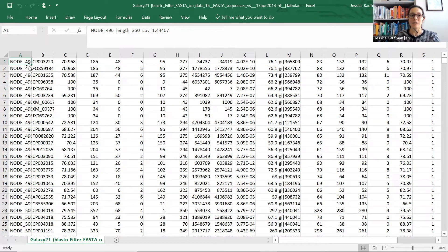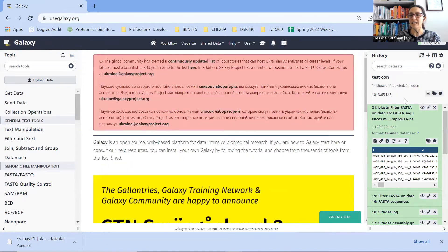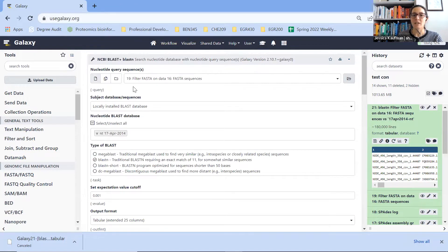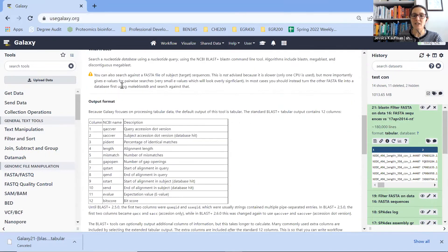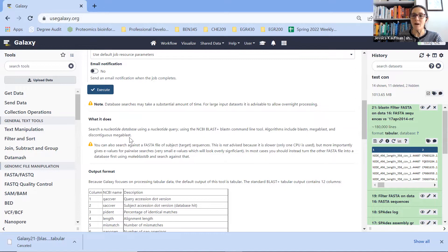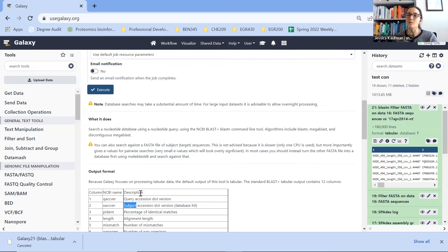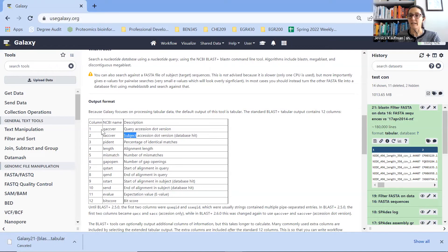The first thing we need to know is what data is in each of these columns. We can find that out if we go back to Galaxy and rerun the BLAST job. We can look below where you click Execute at a whole article about what this application actually does. It searches a nucleotide database using a nucleotide query — the query is what we put in to BLAST — giving back a subject, which is what matches in the database. All of the columns are explained there.